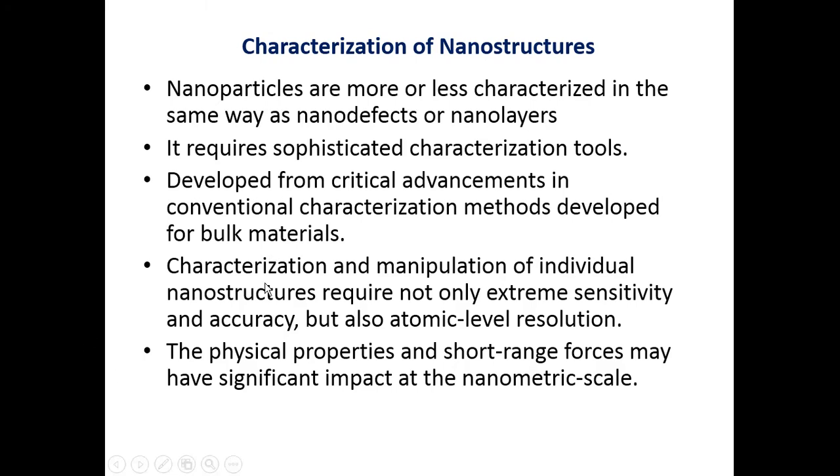Characterization and manipulation of individual nanostructures require not only extreme sensitivity and accuracy, but also atomic level resolution. The physical properties and short range of forces may have significant impact at the nanometric scale.